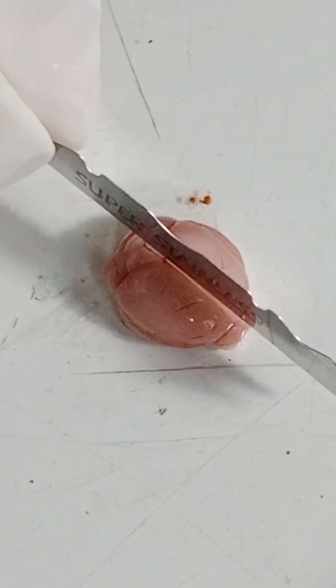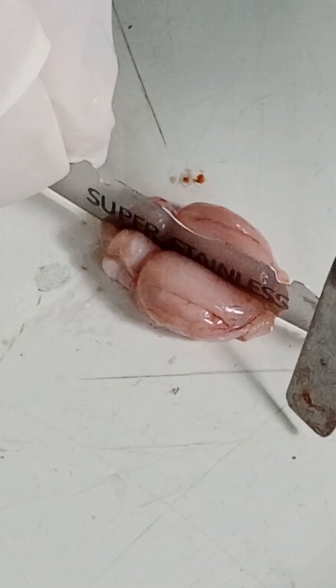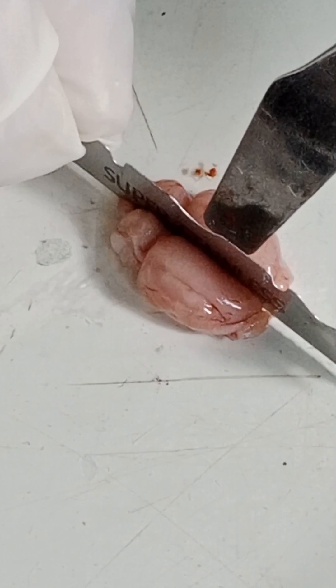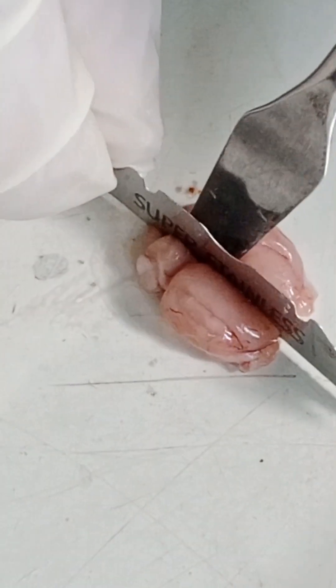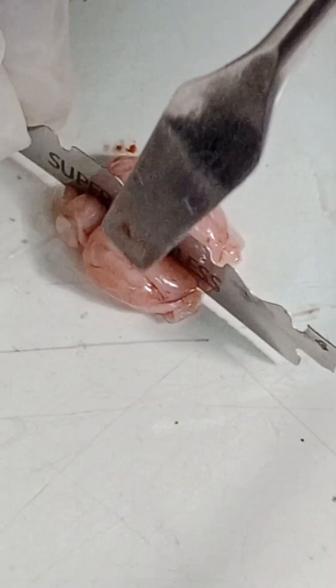Welcome to this dissection of mouse hippocampus. Today we will see how I separate mouse hippocampus from the mouse brain. Here you can see I am cutting a mouse brain into two equal halves.